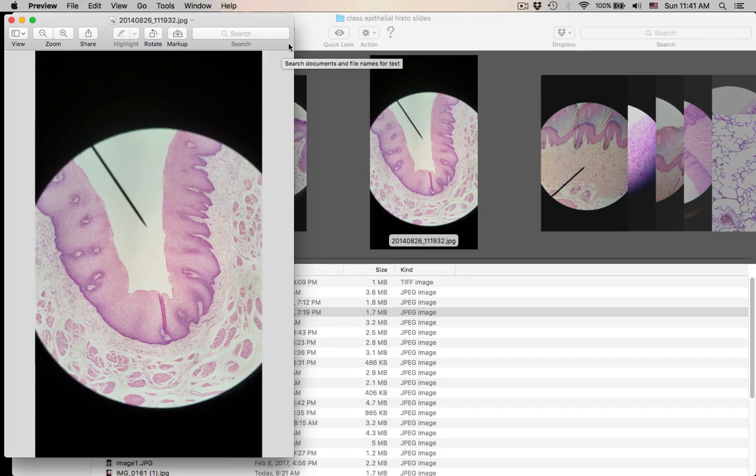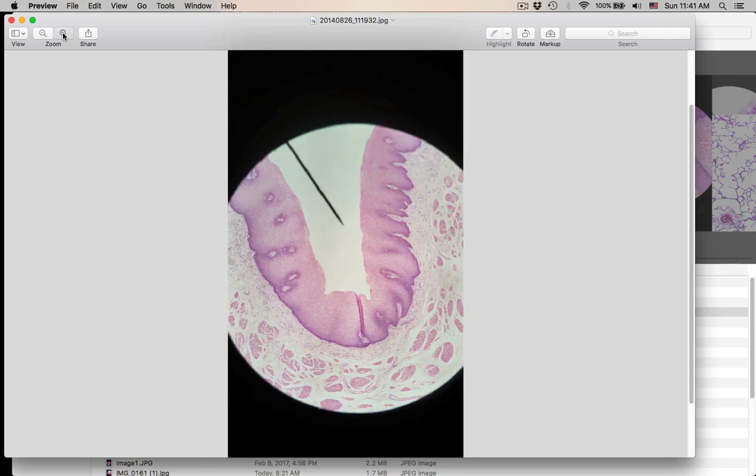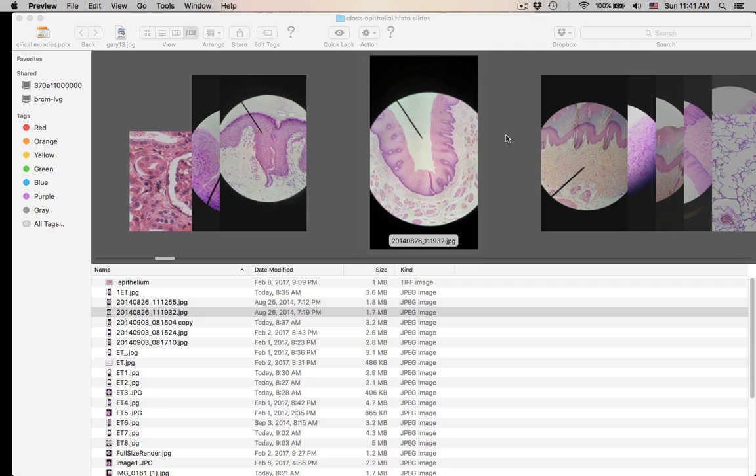What type of epithelium is this? This is obviously stratified squamous. The top layers are flat, non-keratinized. They are still alive at the top. You can still see nuclei up here. So this is stratified squamous, non-keratinized. Make sure you know what keratinized and non-keratinized means.